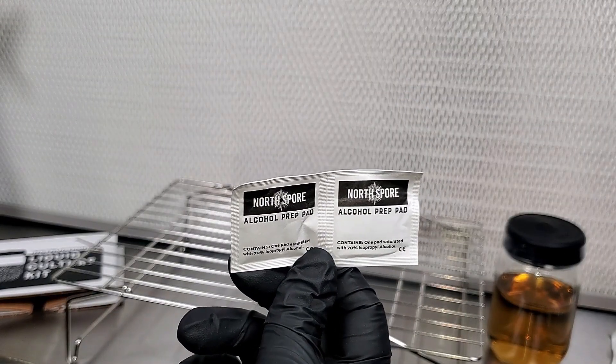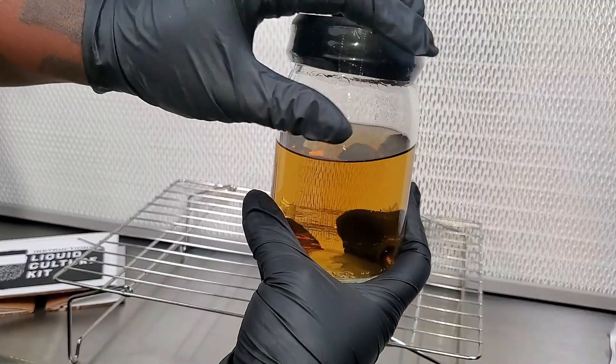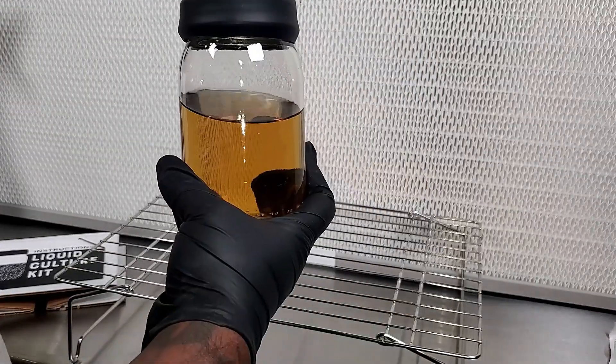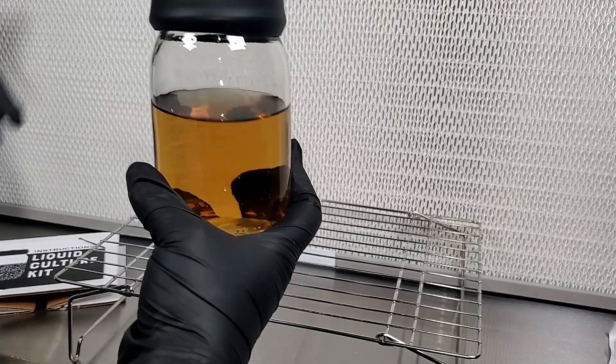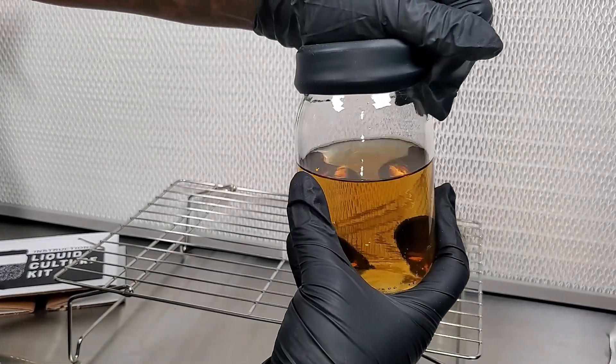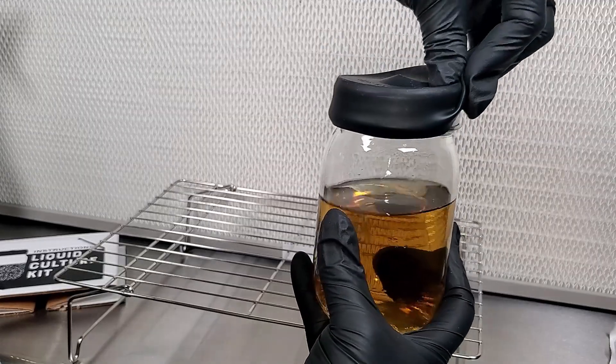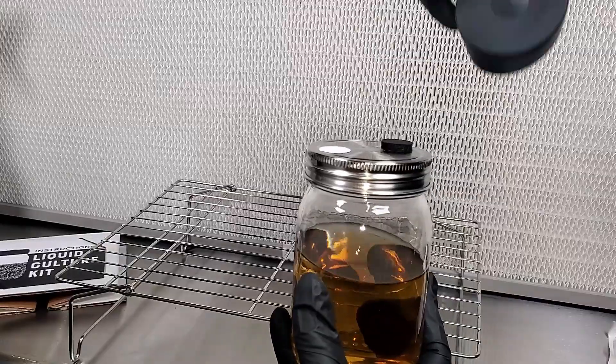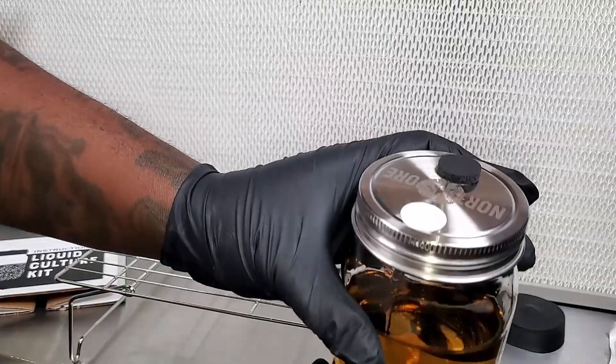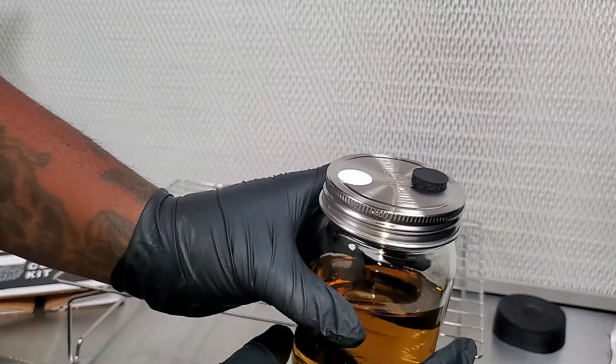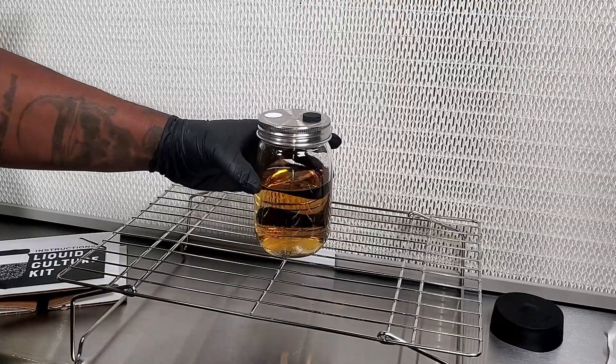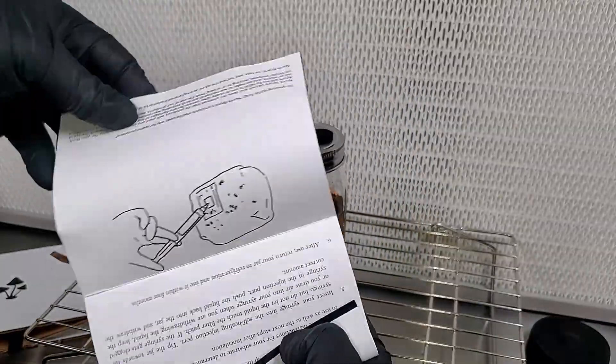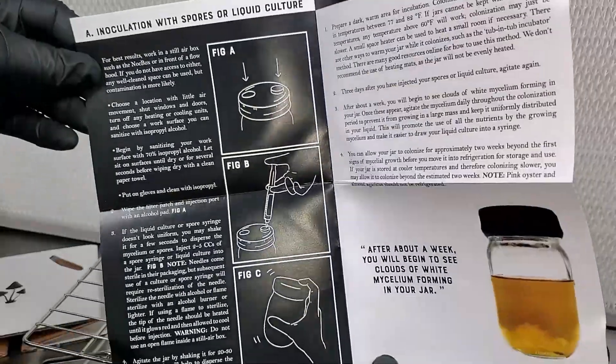All of which you can see right here, I'm actually unboxing everything right now. The first thing that you'll notice is there's a plastic wrap around the top of the jar. That's to ensure nothing spilled during transit. Also, NorSpore recommends waiting at least one week after arrival before injecting your liquid culture kit, just to make sure it wasn't compromised during transit. If it is, if you open it up and it looks cloudy and not clear, just contact NorSpore and they'll replace it for you, no problem. Once I take that plastic wrap off, I'm going to take off that reusable silicone jar lid cover, and this is how everything looks right here.